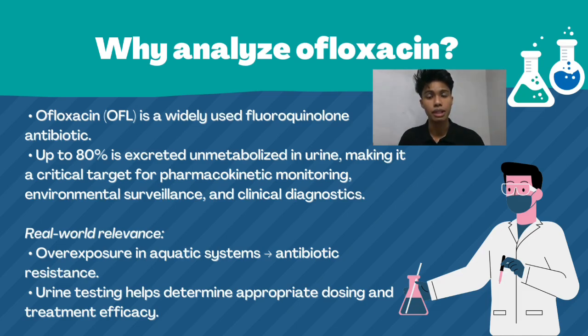It also helps track environmental contamination, since leftover antibiotics in wastewater can cause antibiotic resistance. So, detecting ofloxacin accurately in urine is useful for both medical and environmental purposes.